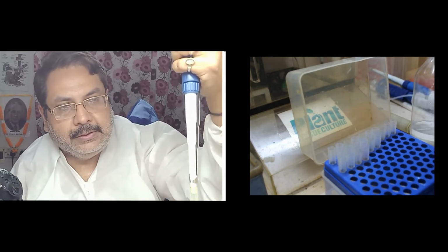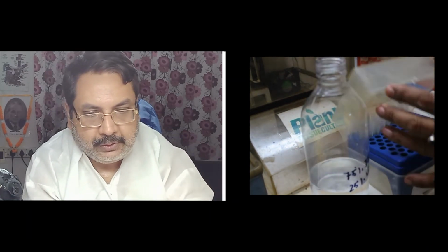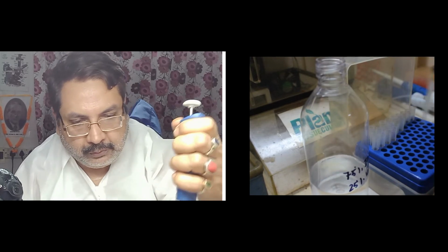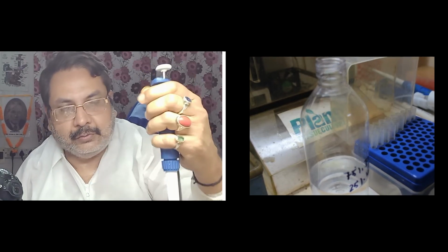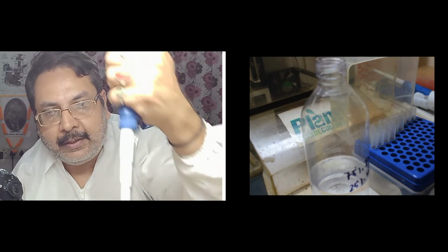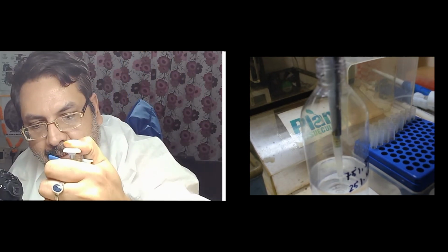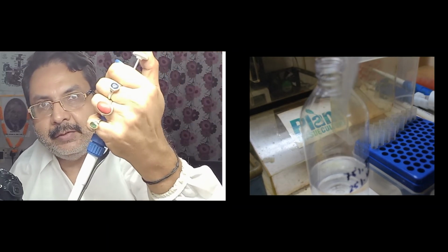Now we can remove this box, and in the camera you can see, this is our box. Now we are going to take the pipette tip, engage the pipette tip, press a little bit and take it out. So it is coming out. Now we have to push the plunger, dip inside the bottle and slowly release the plunger, and the liquid is up. You can see the liquid is up.